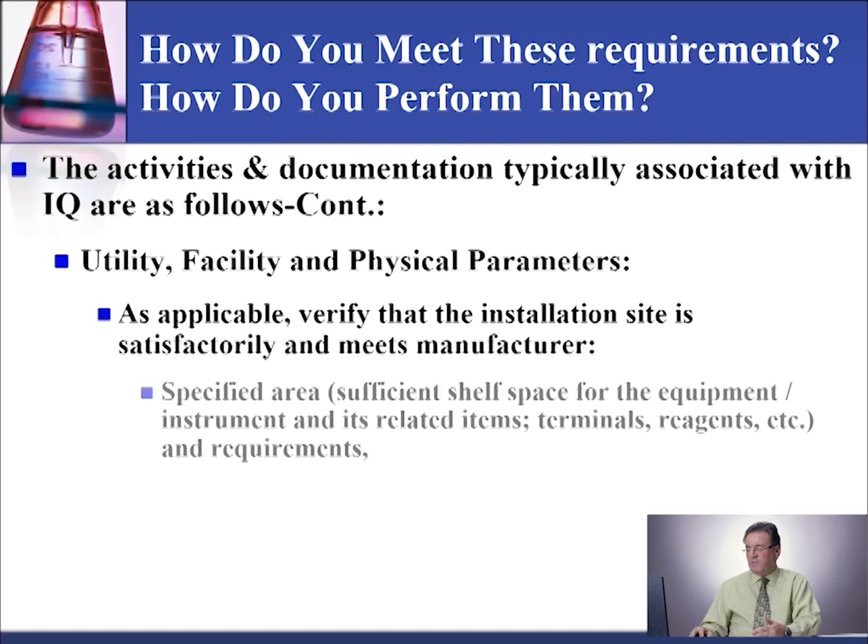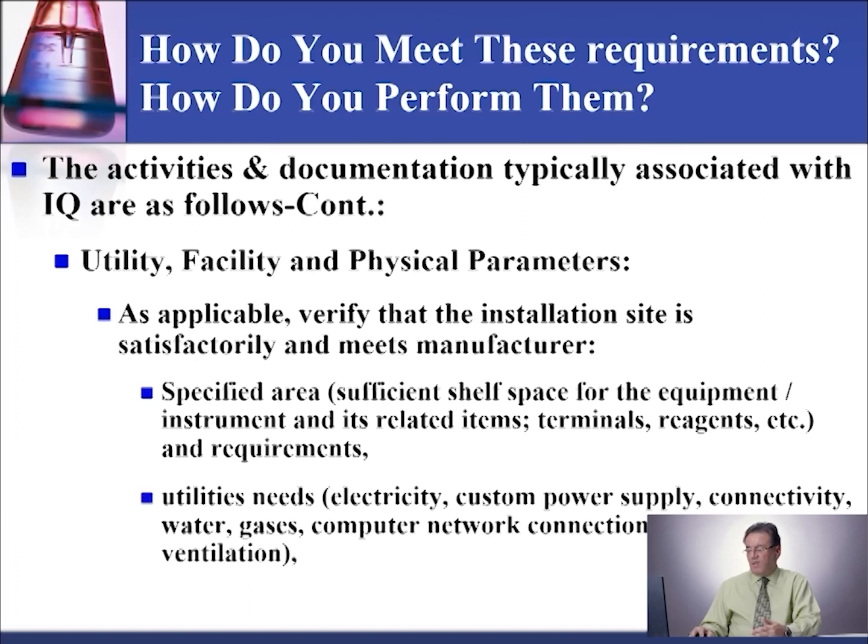When do you repeat the performance qualification or part of it? You can find the requirement for that in the CAP checklist, COM.30550. From CAP: the performance of all instrument equipment is verified prior to initial use, after major component or service, and after relocation to ensure that they run according to expectation.